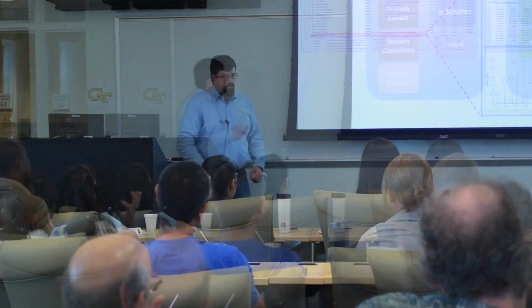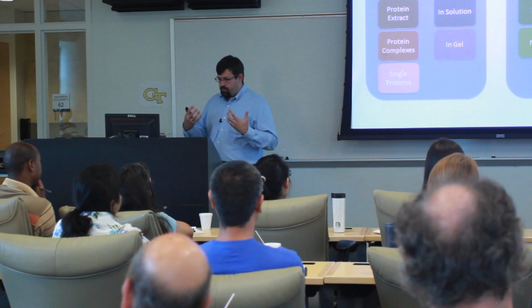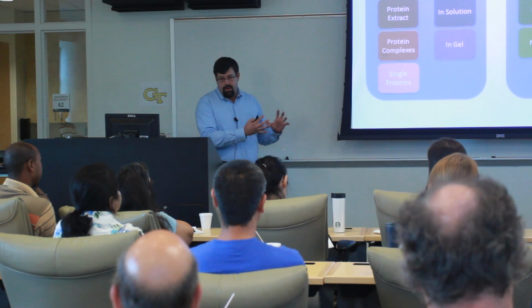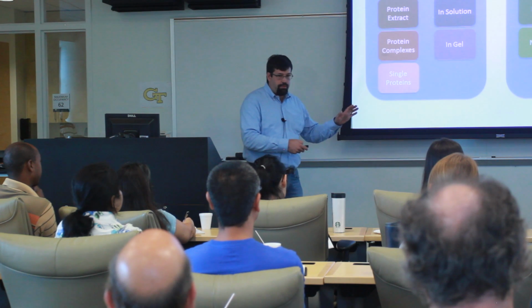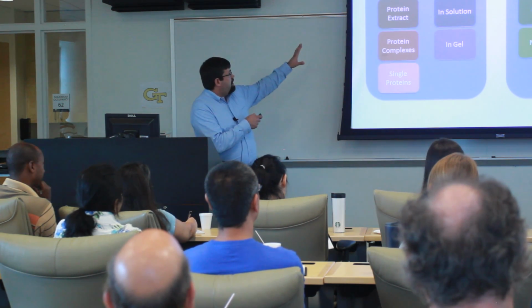I sort of break down anything you're doing with protein mass spectrometry into two groups: the sample preparation side, which is a considerable amount of work, and the mass spectrometry side, which is also considerable, but typically for general protein ID is not going to change very much. Sample preparation, we have protein prep.